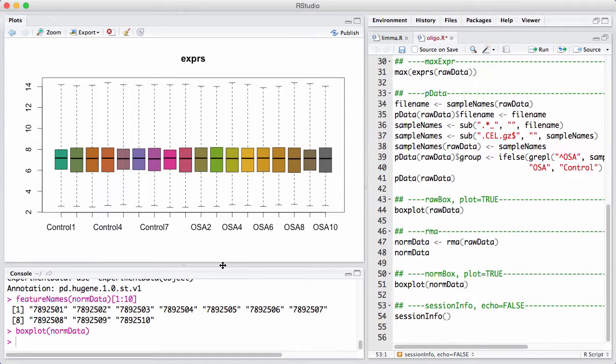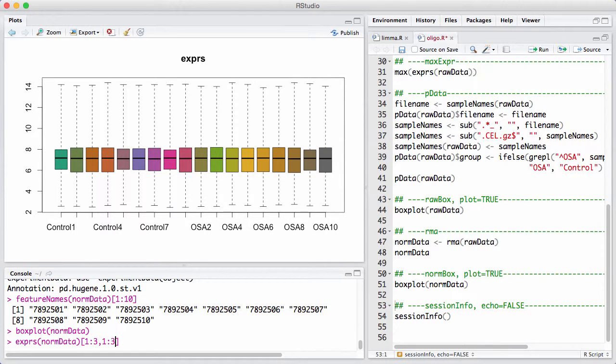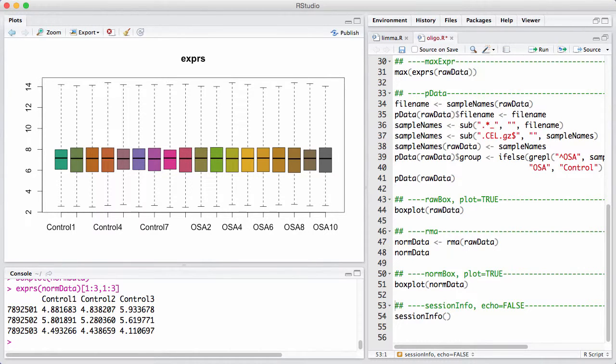The second thing to note is that we now have log transformed values, or we had that before in the box plot, but we can confirm that we do have log transformed and the log 2 is always log 2 in microarrays measurements. And it does look like the samples control 5 to control 7 are not that different from the rest of the arrays. So now we have run RMA. You see how easy it is. And this is like a core thing we can do with Oligo.